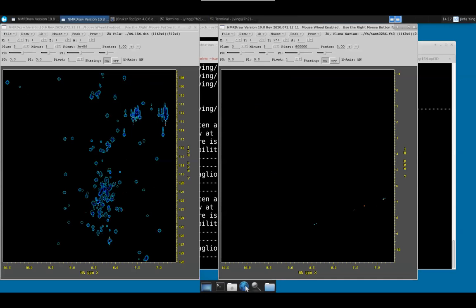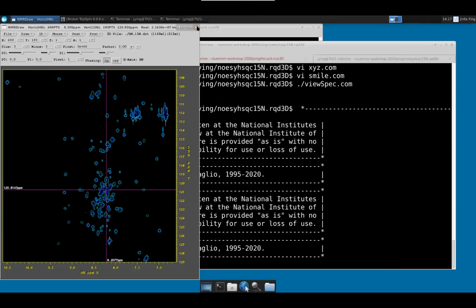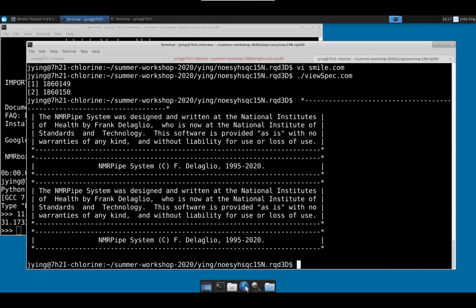And if you go to some of the planes, you see data like that. I use a contour level multiplication of 3 just to draw this faster. Okay. All right, that's another example.